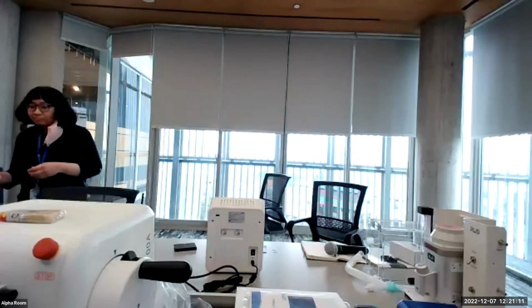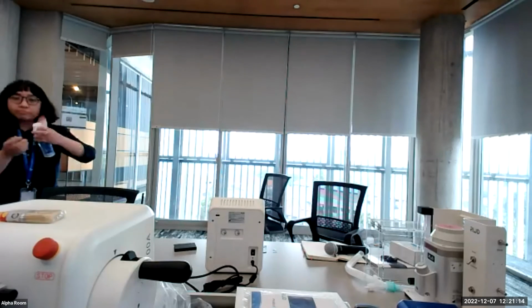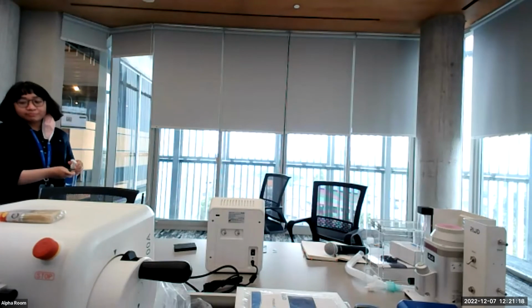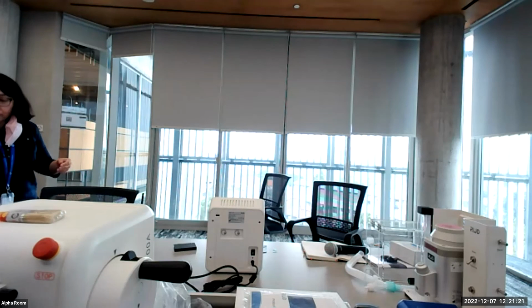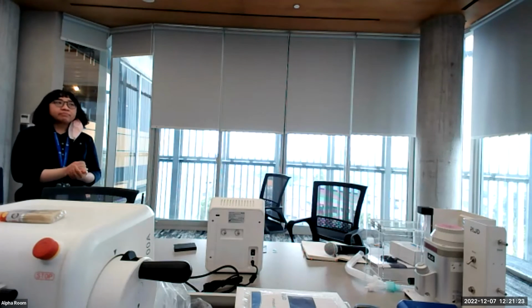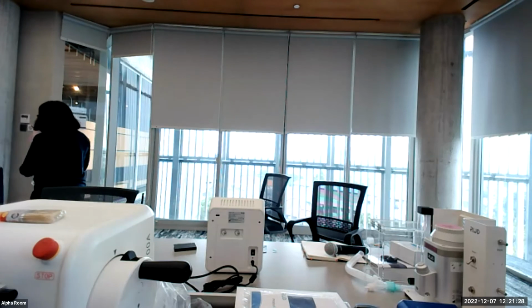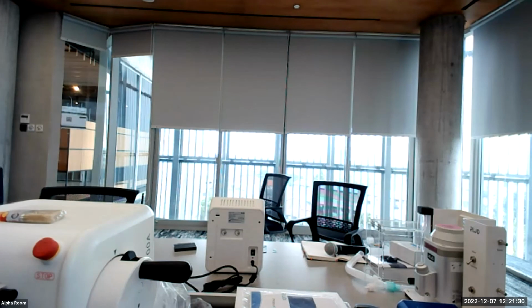So if we use the blade only 10 times, do we have to remove the blade? It depends. If you have some very hard tissue, maybe it's not sharp enough. Yeah, depends. If it's too hard, the worry is that it's not sharp enough.